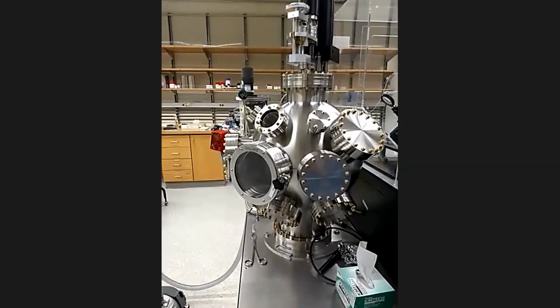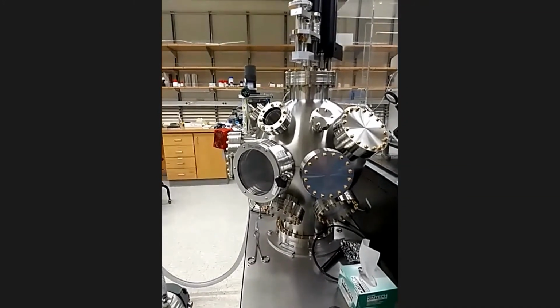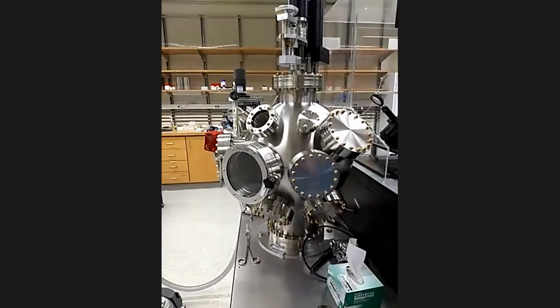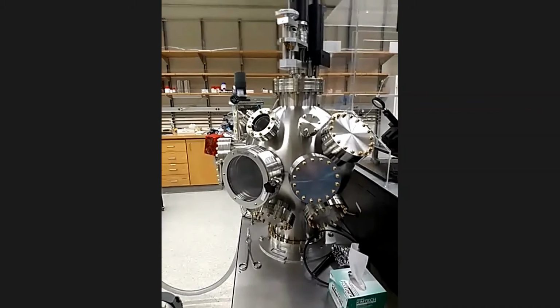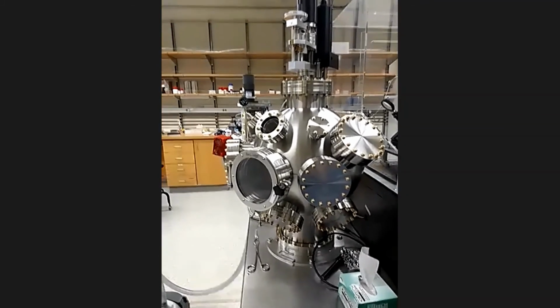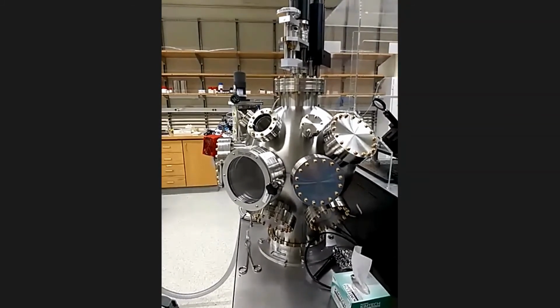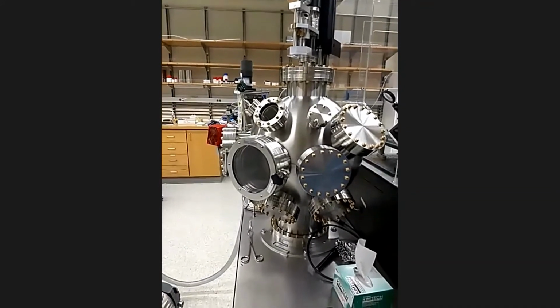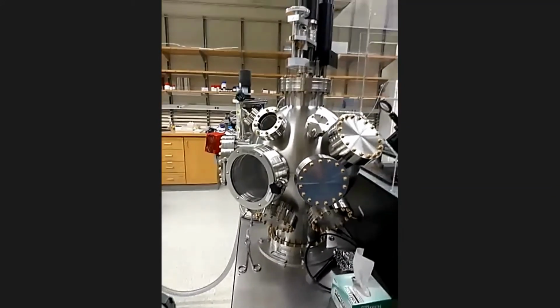If you light a candle, that happens, right? It's exactly the same principle: we fire some energy on the pellet, it shoots up the material, but the material lands according to our defined rule. That's the whole point of PLD.